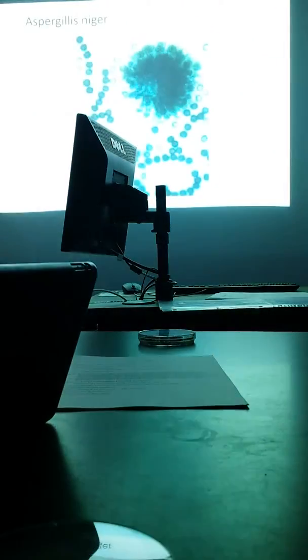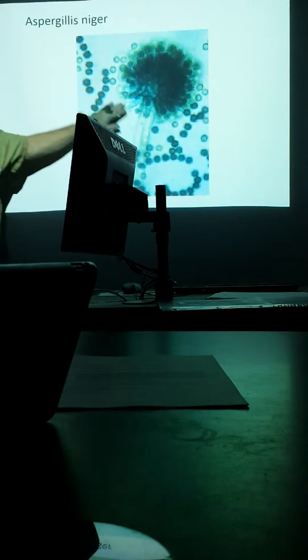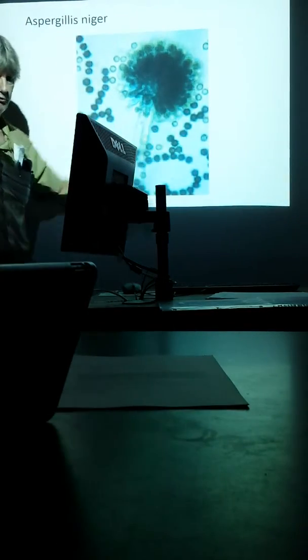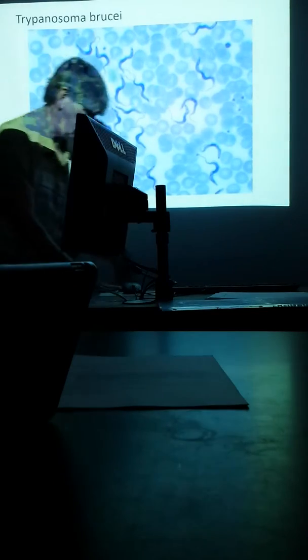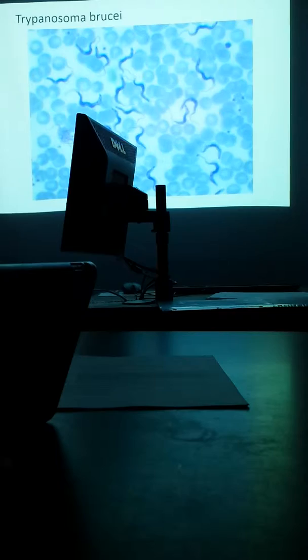Aspergillus itself has, again, three-dimensionally arranged conidia spores sitting into the environment. So again, you see the spores on the edge. Ours usually are pretty stained, real dark in the center, but you can see the little spores sticking off on the edge. And then let me remind you too, I have the dermatophyte picture, which is right here. Again, Epidermophyton for the example, the ringworm example, so make sure you see that one as well.